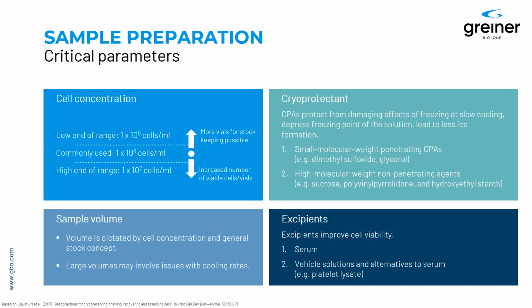A famous or well-known example for the first group is DMSO, also glycerol, and in the second group we find sucrose as a very often and widely applied cryoprotectant.